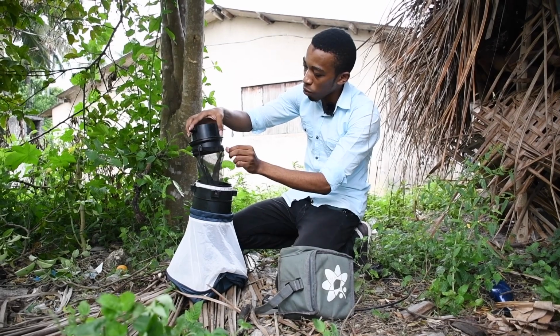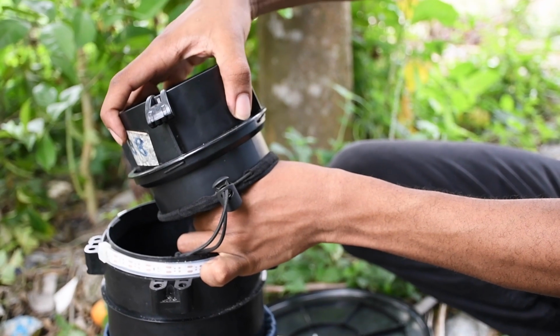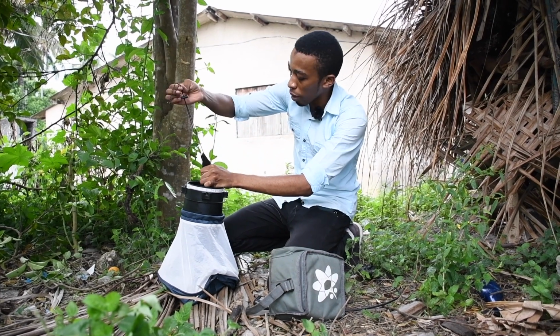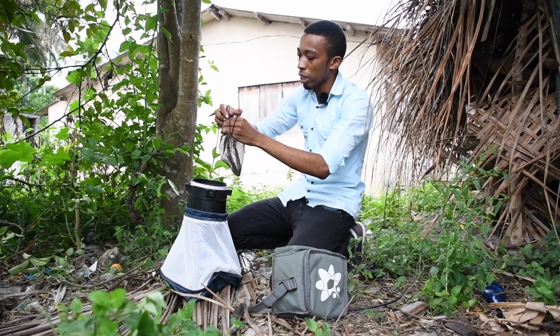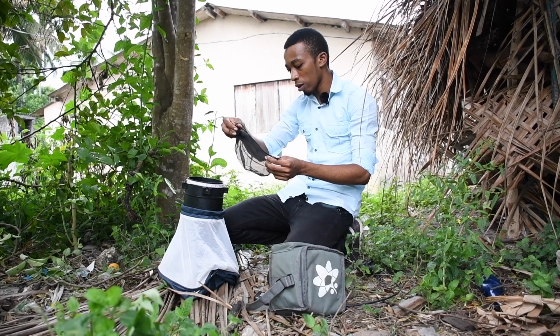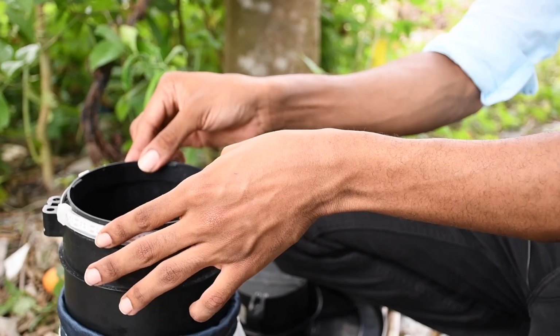And then we pull it down slowly, and then we hold it tight on the top of the net, and then we remove it, and then we pull the grip, the neck of, there it is, the mosquitoes are now secured. And so we place the collected mosquitoes in the cool box. Now we can disassemble the trap.